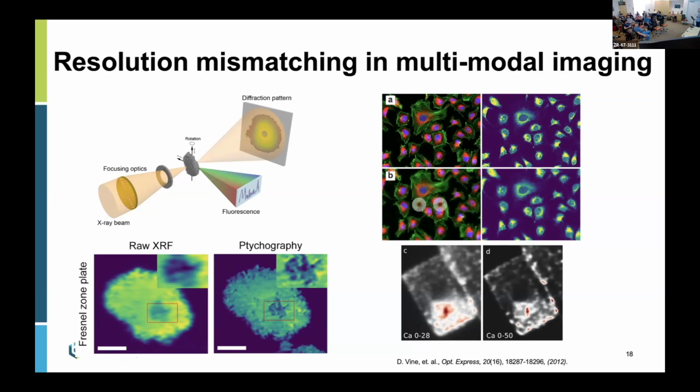In the meantime, recently we learned that the neural network is very good at conducting convolution and deconvolution calculations. That inspires us to look for machine learning solutions for this problem. So here we focus on the fly scan data acquisition.